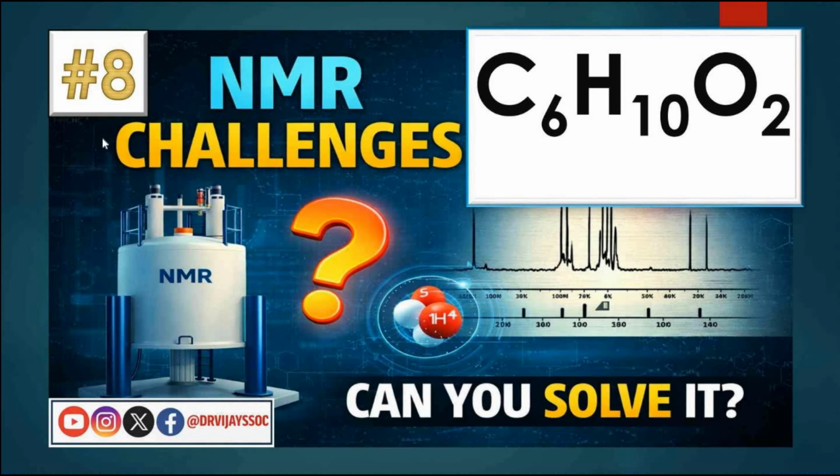So this is our 8th NMR challenge in which we are going to determine the structure of the compound having molecular formula C6H10O2 from the given 1H NMR and 13C NMR. And this problem is very interesting because it is not easy to determine the structure of this compound.